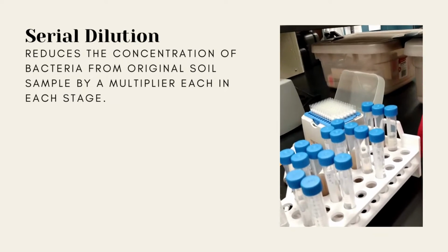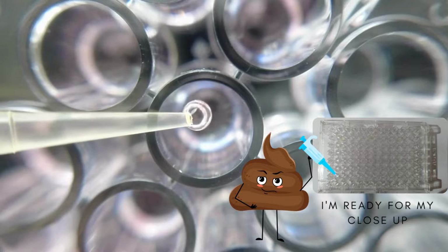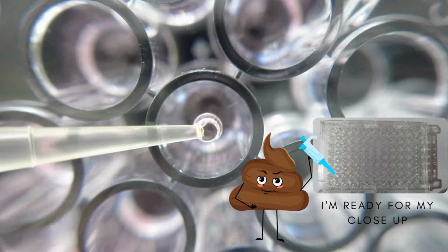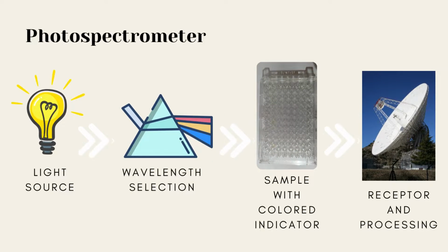Once we've made our dilutions, we're going to put a little bit of our dilution into each well of a microplate, and each of the microplate wells, and there are 96 of them, have different substrates. And how we're going to measure that is using a spectrophotometer. We put the microplate with all the wells, with the bacteria and the substrates, into a machine that passes light through it.